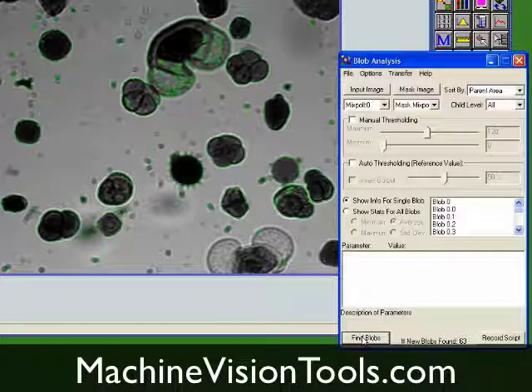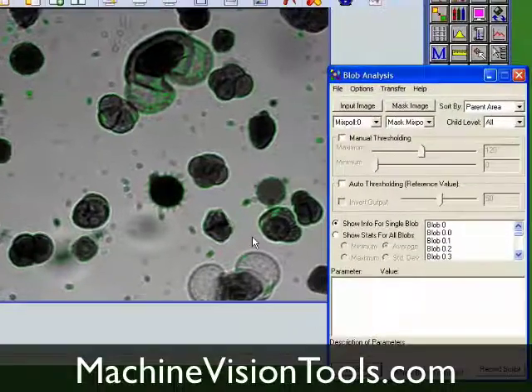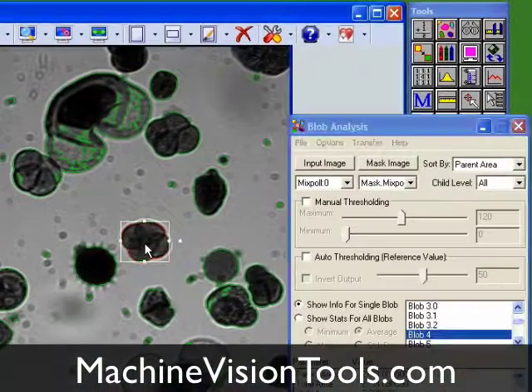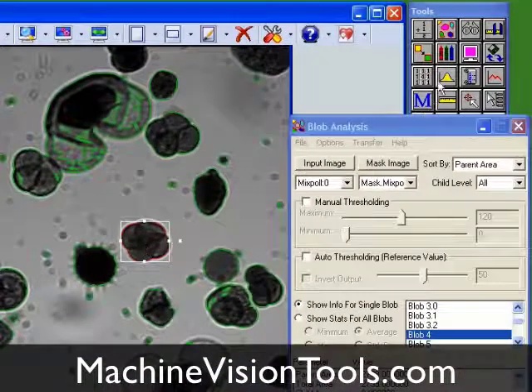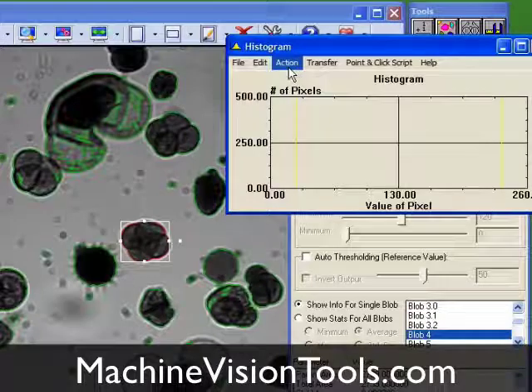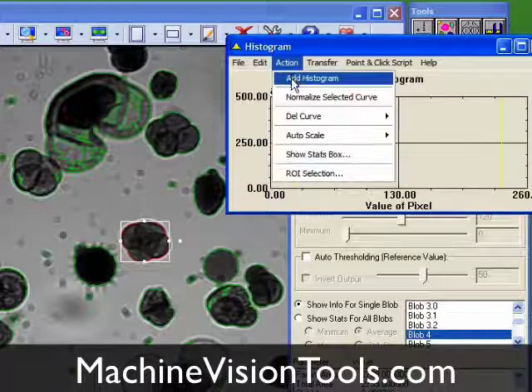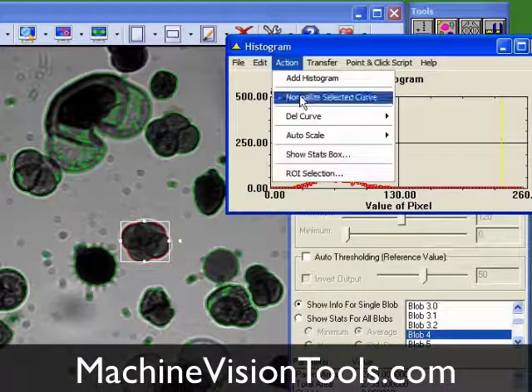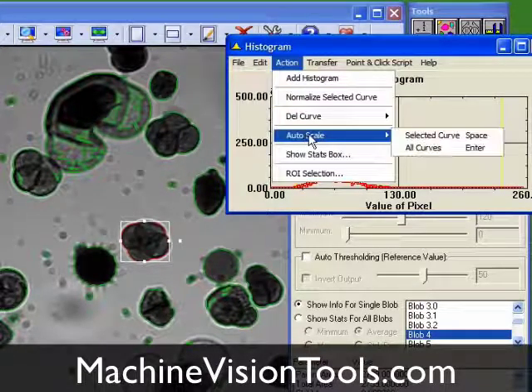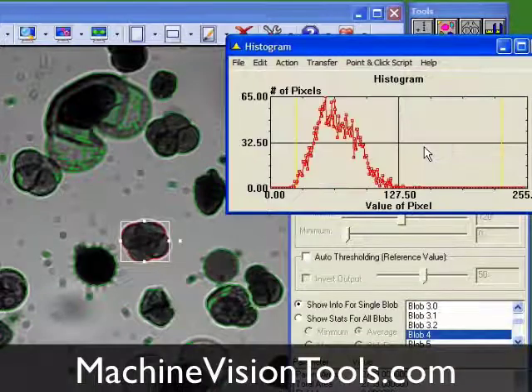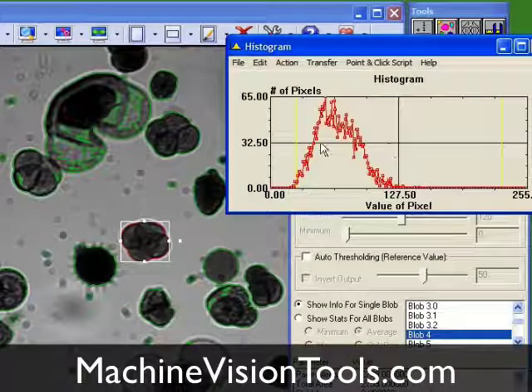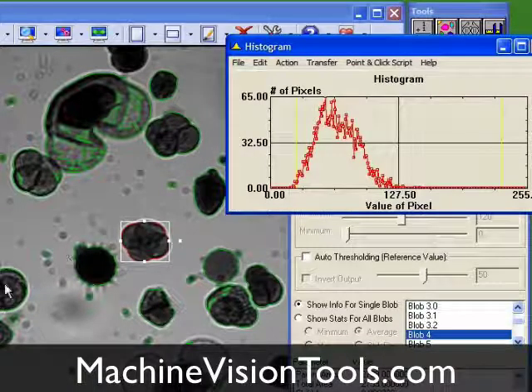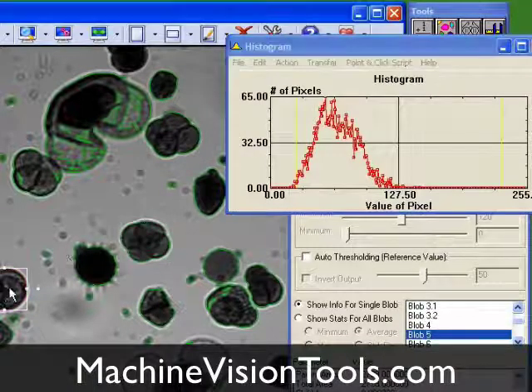Each blob can be used just like any other ROI. For example, we could select a blob, open the Histogram tool, and create a histogram of its pixel brightnesses. We'll scale the histogram to show the curve more clearly, then select some more blobs and add their histograms.